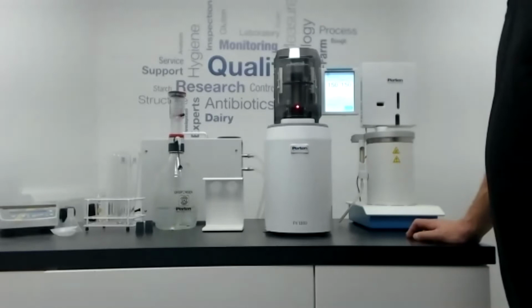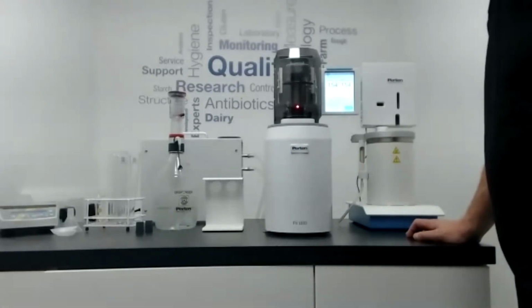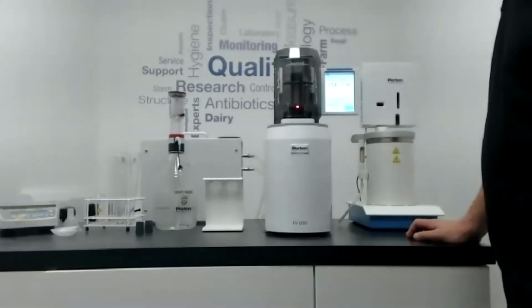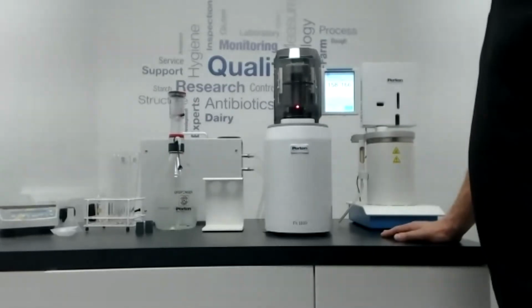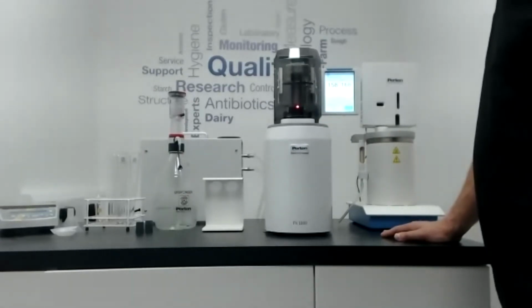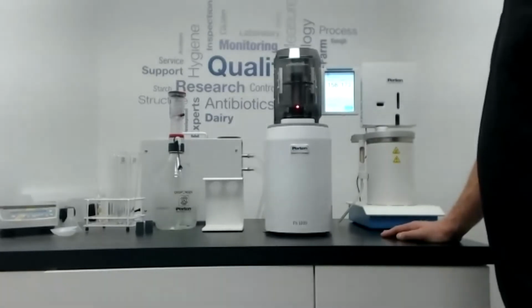Okay, so we can see the difference straight away. The pre-sprouted grain is completed. And on this new model, all the results are stored internally. There's a procedure where you can put a USB stick in the side and you can extract the data.